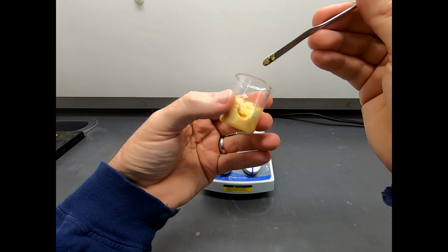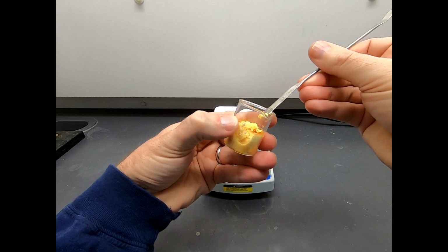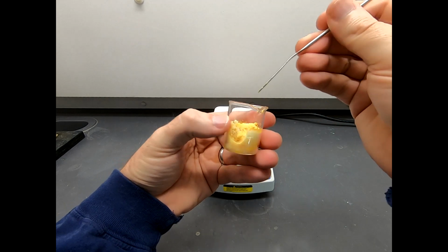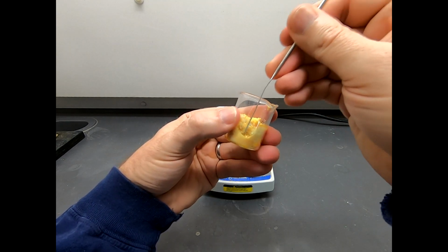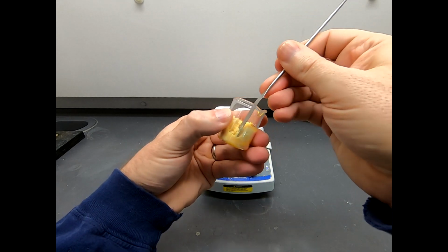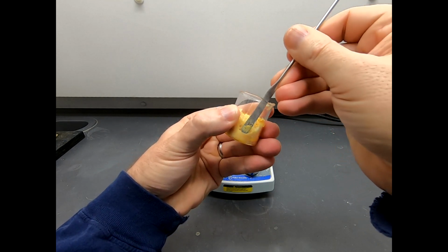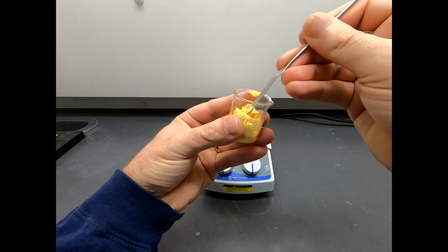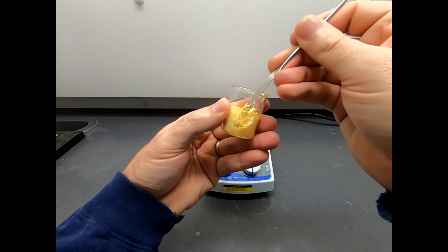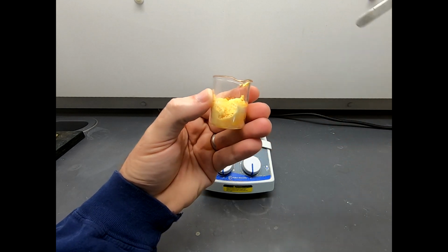Now, I will note I'm a pretty big fan of using scintillation vials as reaction flasks, and I could have done that here, but a scintillation vial has a slightly narrower neck, and it would be a real pain to get in here and dig this stuff out with a narrower neck. So I'm glad that I used a beaker for this. That wasn't my intent, but as I work with this, I'm glad I'm not confined to a scintillation vial and I have these straight walls of a beaker to work in. So I'm going to try to grind this up and break it up, and then we'll go on to the next step and try to isolate this product.